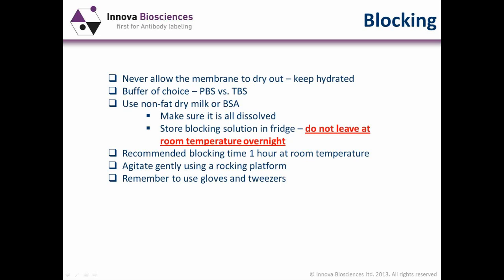Don't wipe your hands all over your face and then start handling the membrane with your gloves. All you're going to do is transfer contaminating proteins from your face to the membrane itself, and you're going to end up with a high background when you develop the Western blot later on.